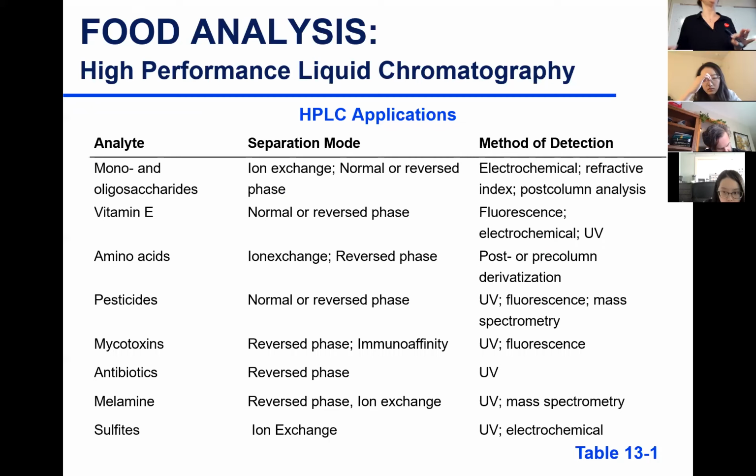So we will be talking about methods of analysis. In a quiz or an exam, I would tell you, okay, what chromatographic technique would you use for such an analyte? You will tell me GC, HPLC. If you said HPLC, I will tell you what's the mode of separation. You will tell me the mode of separation. Then I tell you what's the mode of detection. When I say mode of detection, I want you to tell me what detector you're going to use. Okay, so learn these terms. When I ask mode of separation, you know, reverse phase, normal phase, ion exchange, so on. Method of detection, what detector would you be using to detect your component?